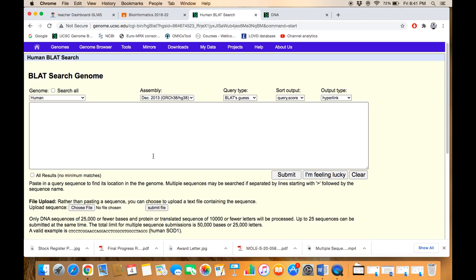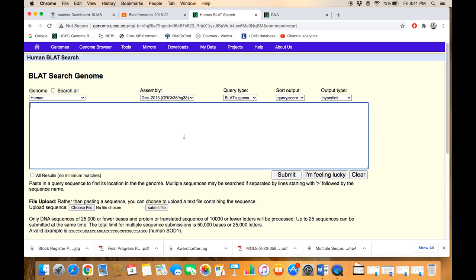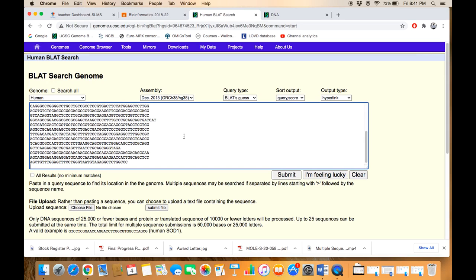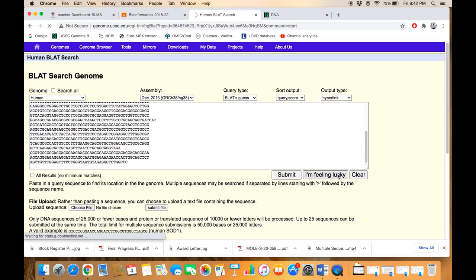Now, for the sake of practice, say we introduce certain variations—substitution and insertion—within this query sequence. Let's try and see how it works. Just paste the sequence and click on 'I'm Feeling Lucky.'